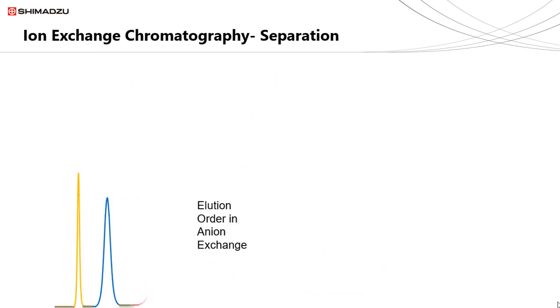Knowing that anion exchange creates separation of negatively charged compounds, we can now look further at how it would separate different anion compounds. Separating fluoride, chloride and bromide, the elution order would follow the relative size of the ion, the smallest ion size having the weakest interaction and therefore the first eluter. Separating nitrate, phosphate and sulfate would work in the same manner.